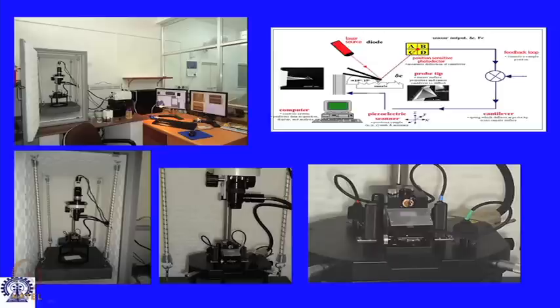So with that, you can see the same figure again. This is the schematic of an AFM with the hardware elements we have talked about already: tip and probe, the piezoelectric scanner, the photodetector, the laser source, and the feedback loop. This is how a commercial AFM looks. This is all interfacing and computer. These are the controllers, what you can see over here.